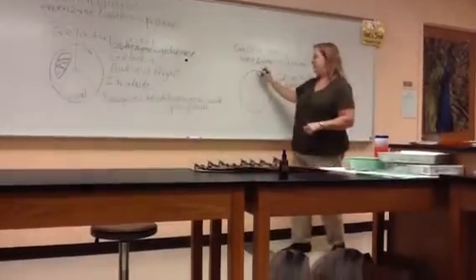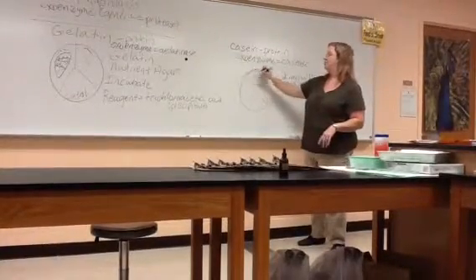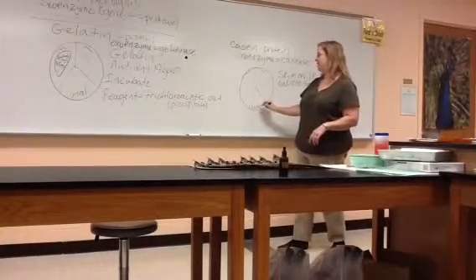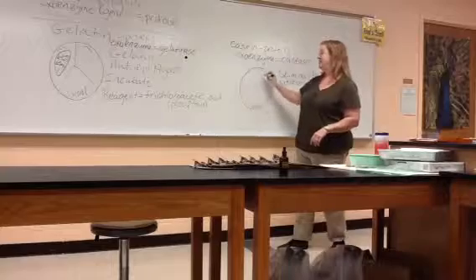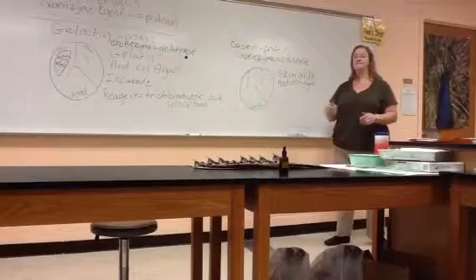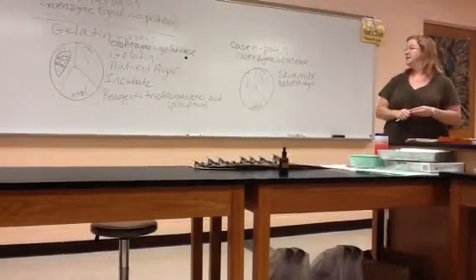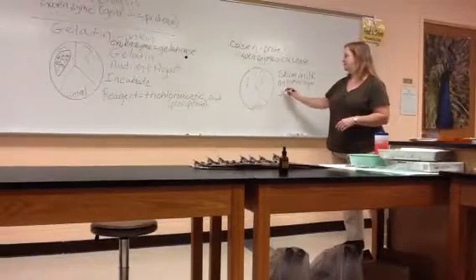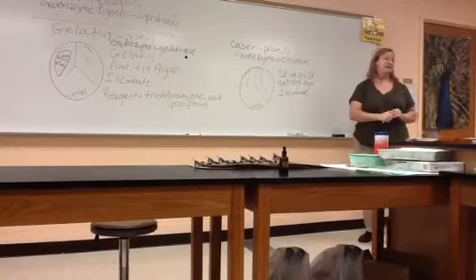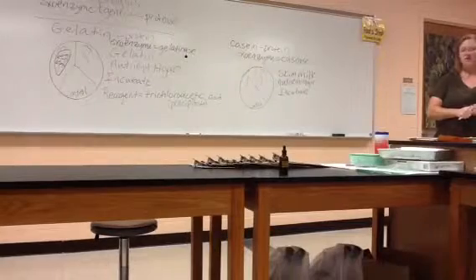Same thing, you're dividing the plate up into 3 sections, reading your procedure to see which 2 bacteria you're supposed to use for the casein test. And you have a control section of the plate again. And again, it takes me longer to tell you than it will for you to do it. You're just adding aseptically 1 short, straight line of bacteria in each section. And we're not trying to get isolated colonies here. And you incubate, as always, same time and temperature. There's no reagent for this one because casein already has a white color to it. We're not going to have to add anything for color change.